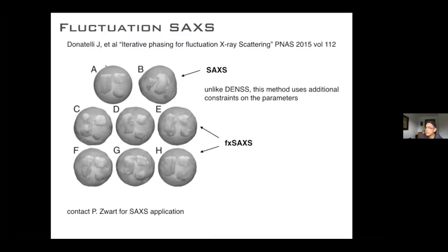incorrect. What he was doing here was thinking about applying additional SAXS data in terms of fluctuation X-ray scattering, and how much you need to add back until you recover the correct distribution of the voids in the shape. This is really neat because it shows that if you collect low resolution small angle X-ray scattering data correctly, you can recover some very interesting information. But right now, this is not typically applied to BioSAXS because it works in theory, and a lot of times in the actual data, you can't see the features you need above the background.